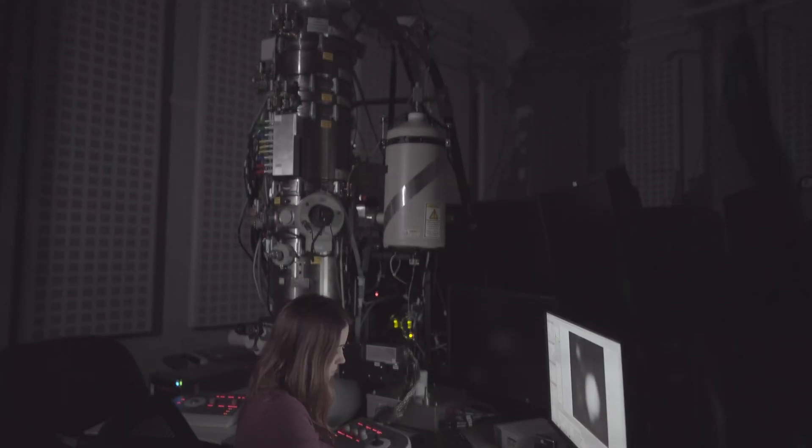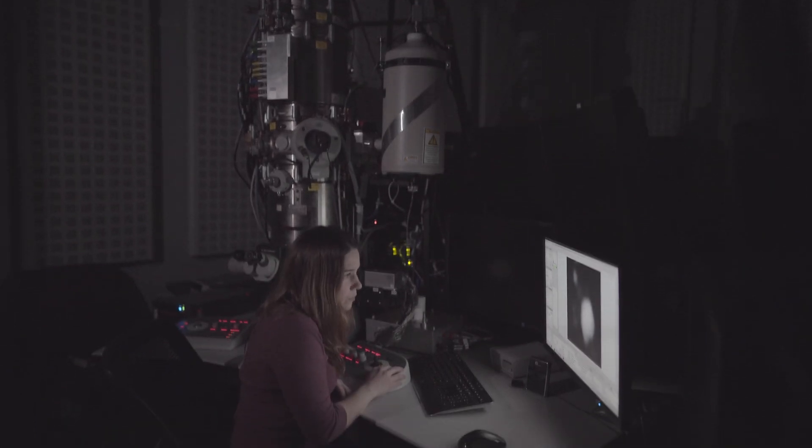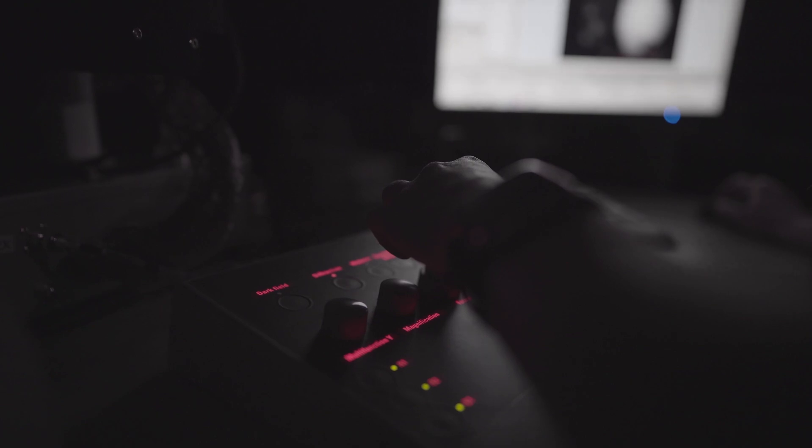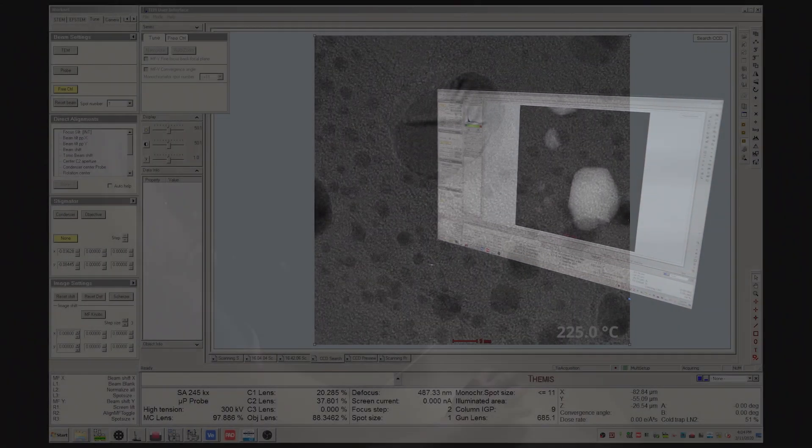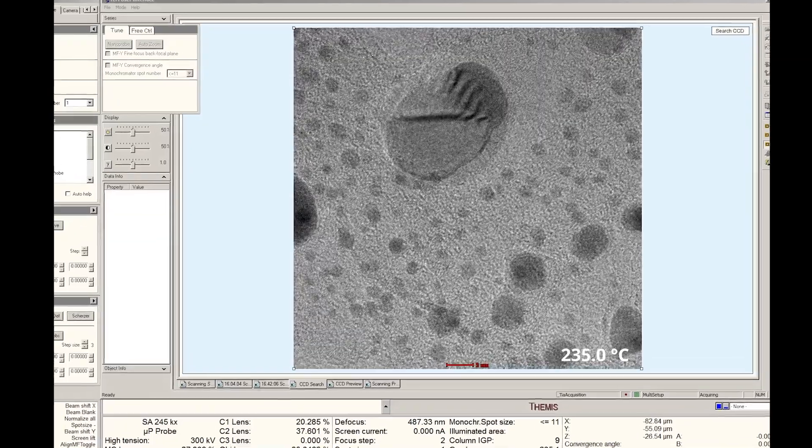Welcome to our virtual look at the new Protochips TEM platform called Axon. We have installed one of the first Axon systems on the Titan Themis at NC State University in Raleigh, North Carolina. Axon is compatible with Thermo Fisher Scientific and JEOL TEMs, as well as the most popular TEM cameras and stem detectors used on these columns.